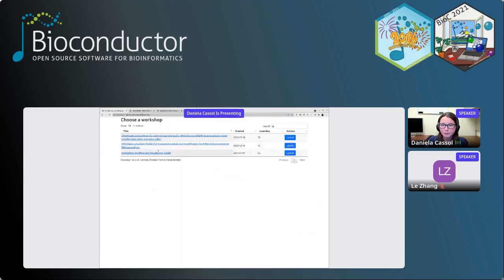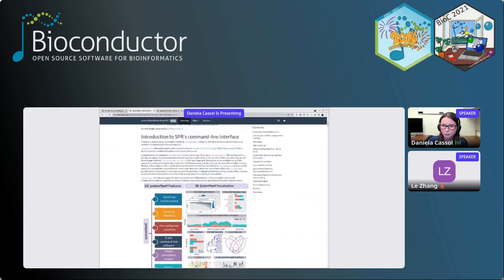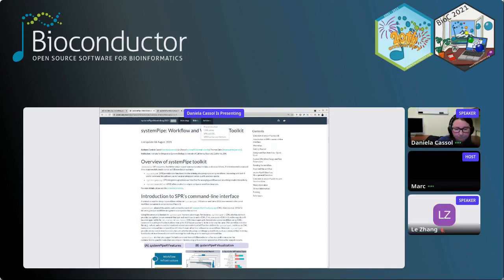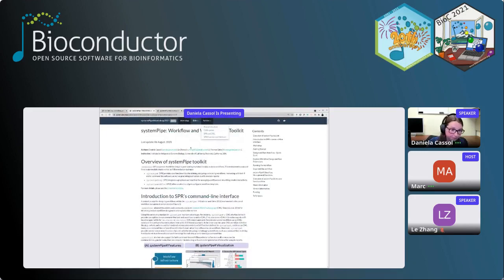So here, as I showed before, you can find our website. If you don't want to go to RStudio, you can follow everything I'm saying on this main vignette. I have all the code here. Actually, I have more information than I will cover today. The idea is for this vignette to serve as a future reference. Then, as I said, you have the slides here, and then we have extra materials. Those extra materials I link in the main vignette, but you can come here if you need more information.